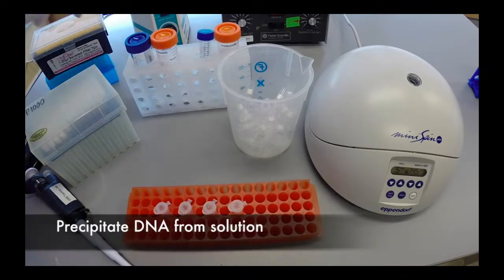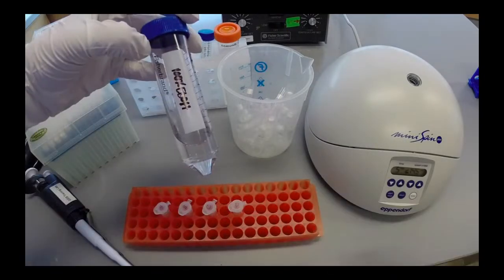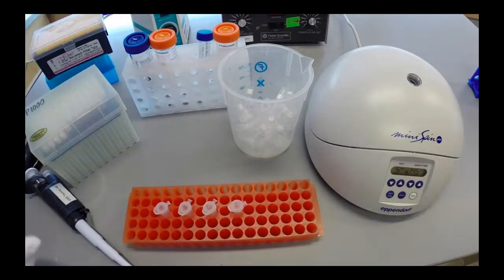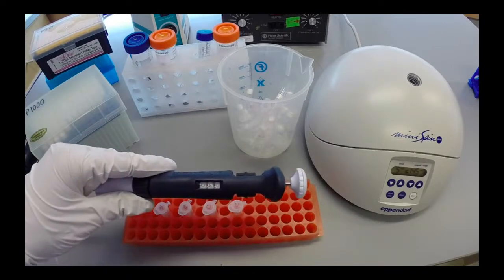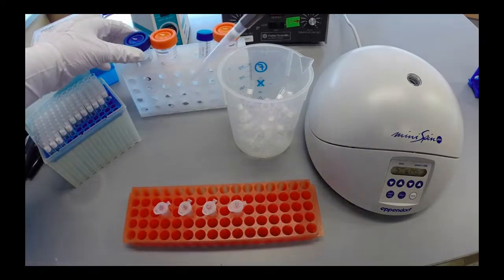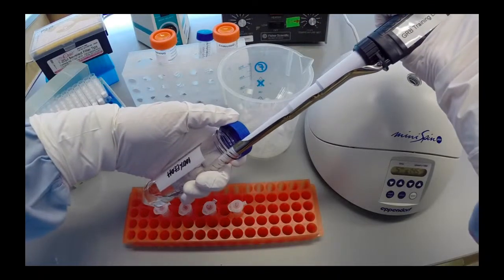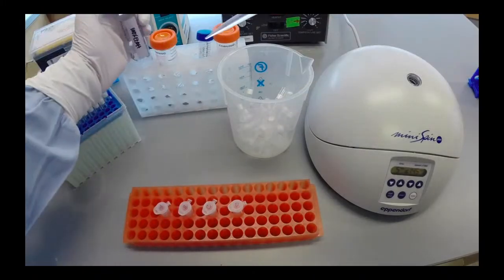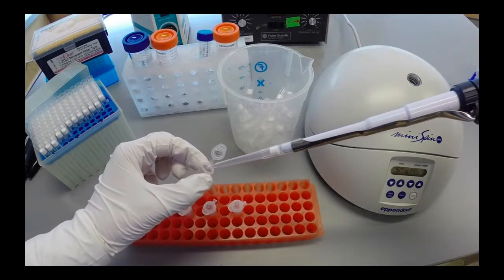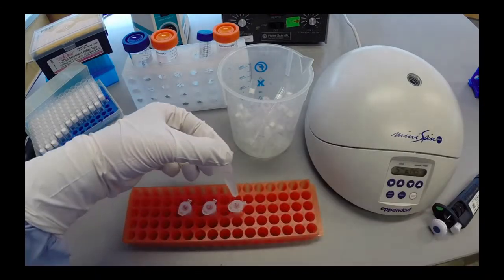Precipitate the DNA from solution by adding an equal volume of 100% ethanol to each sample and mix by inversion 10 times. The solution may become cloudy. This is normal.